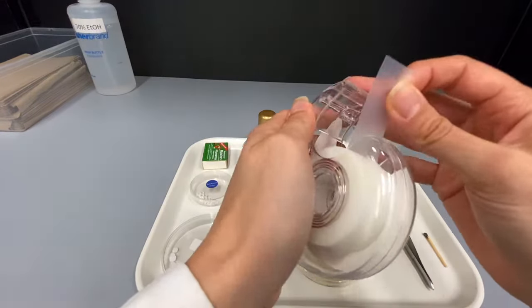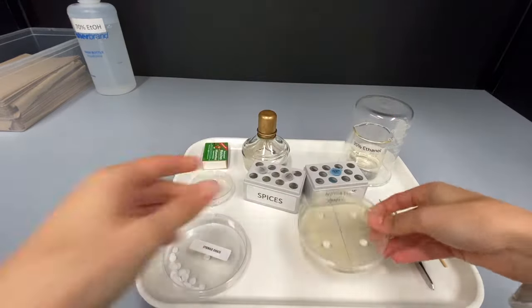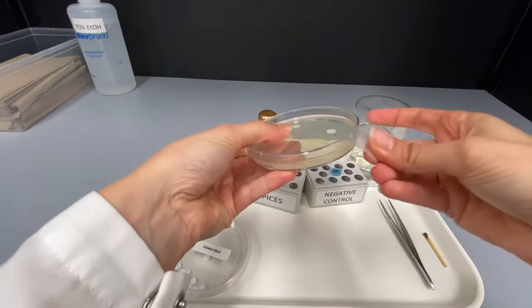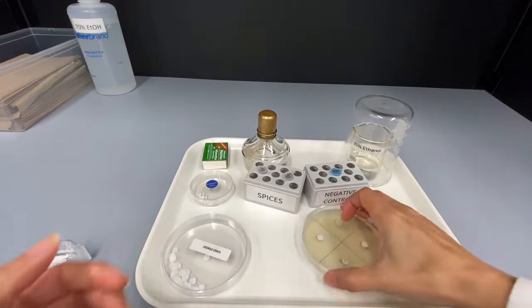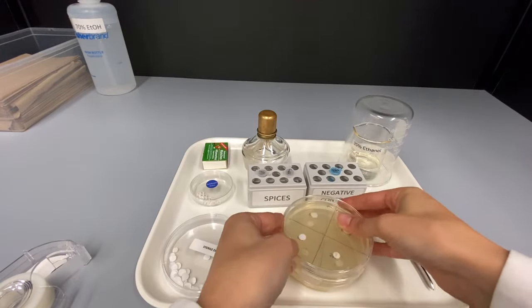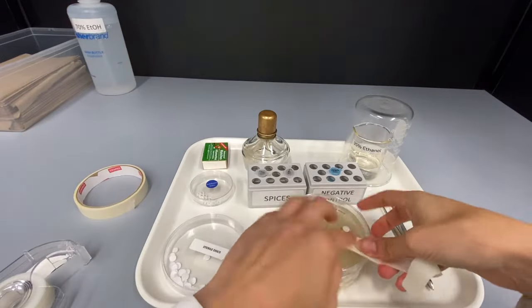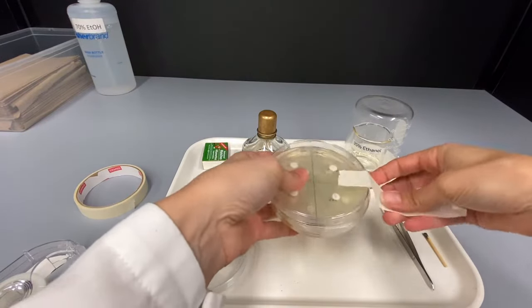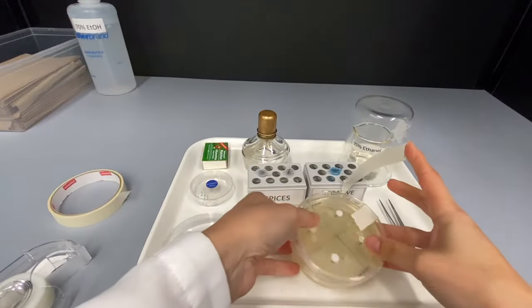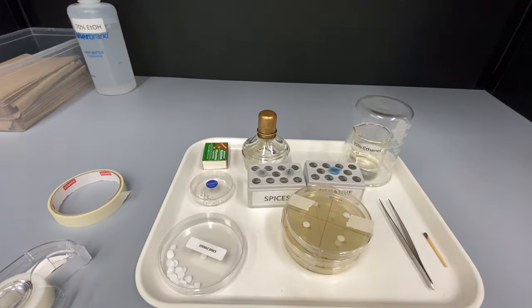You can now use a small piece of tape on each side of the plate to ensure the lid is secure. Combine all of the plates from your group and secure them together with more tape. The sealed plates will now be placed in the 37 degree incubator overnight to allow the bacteria to grow.